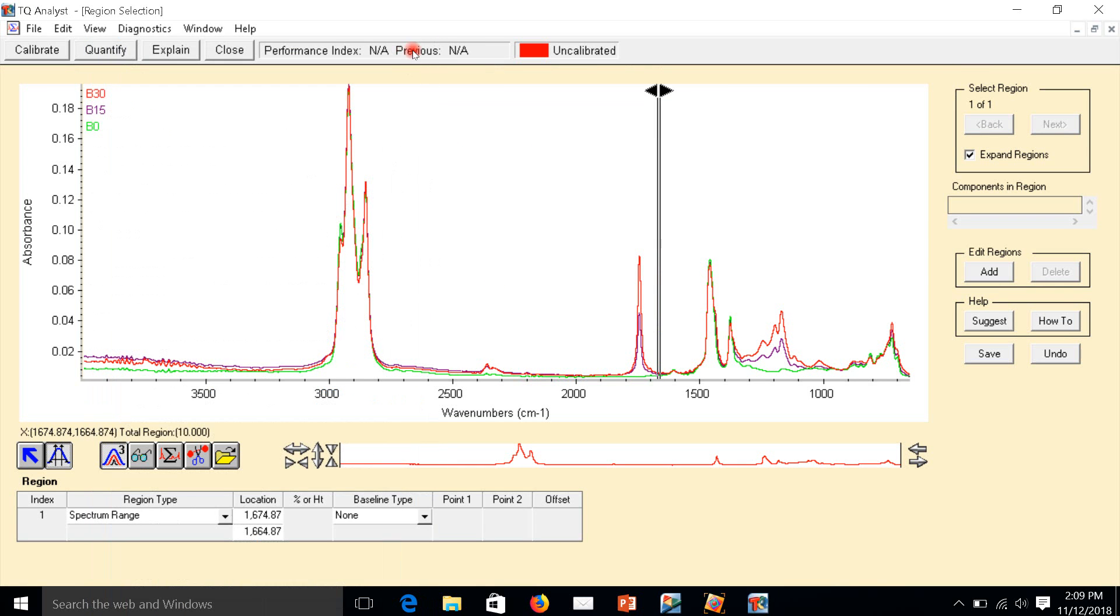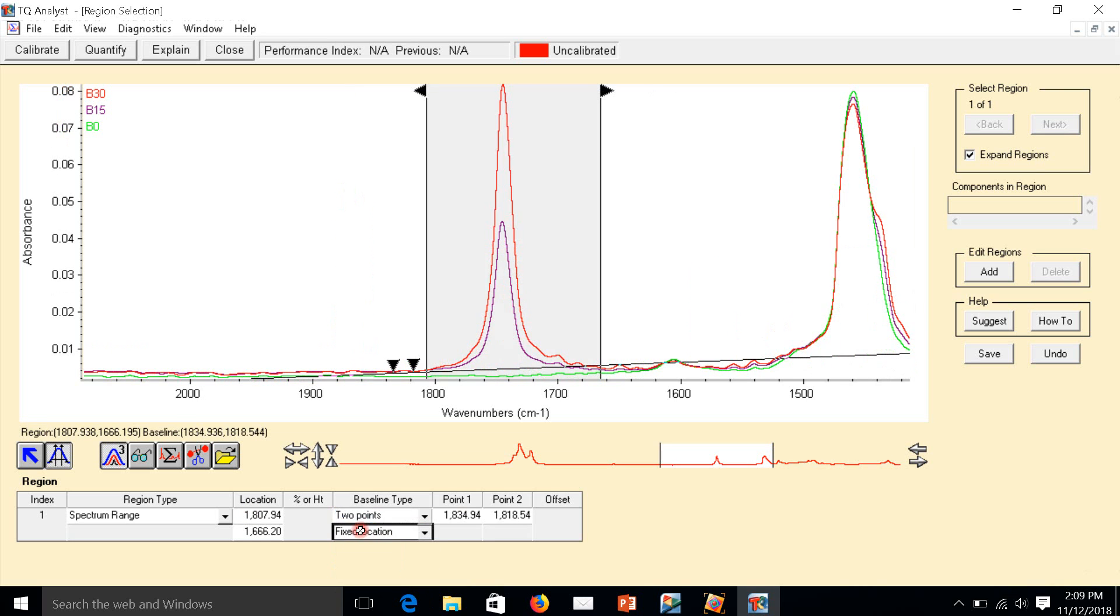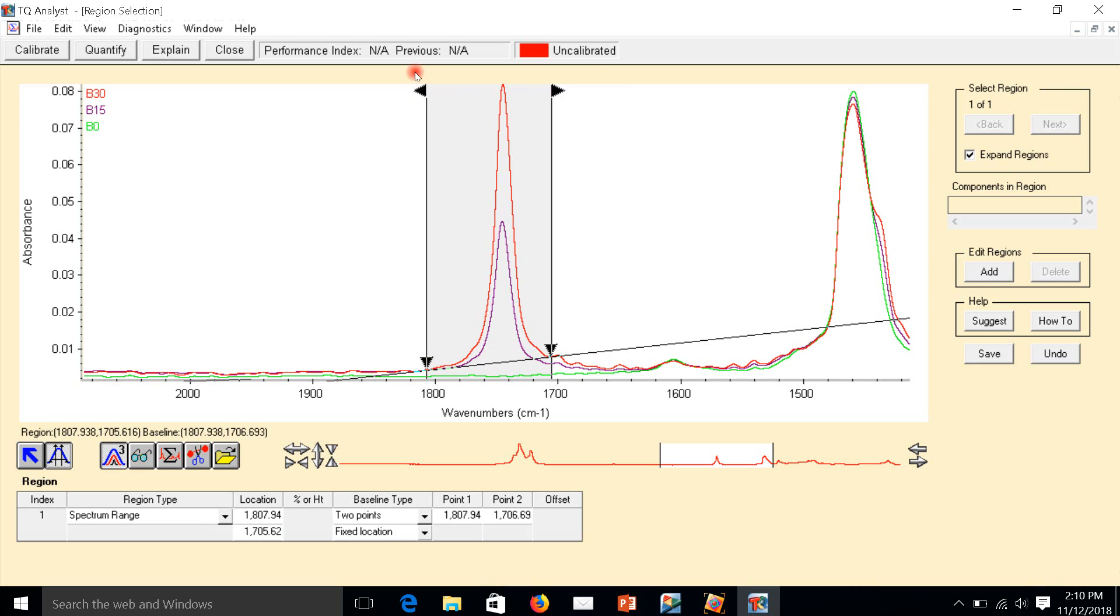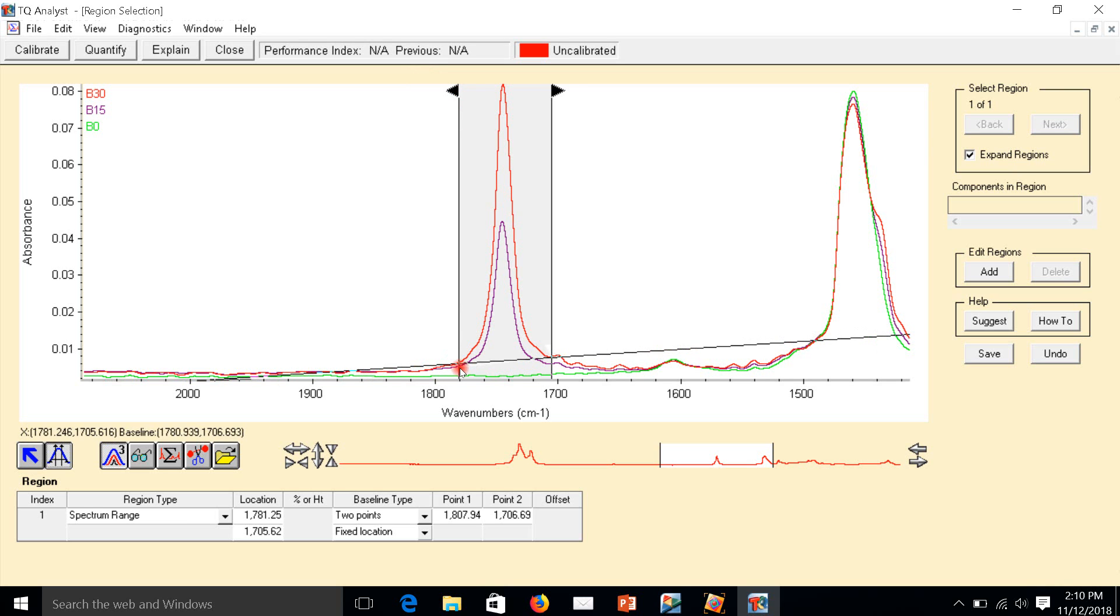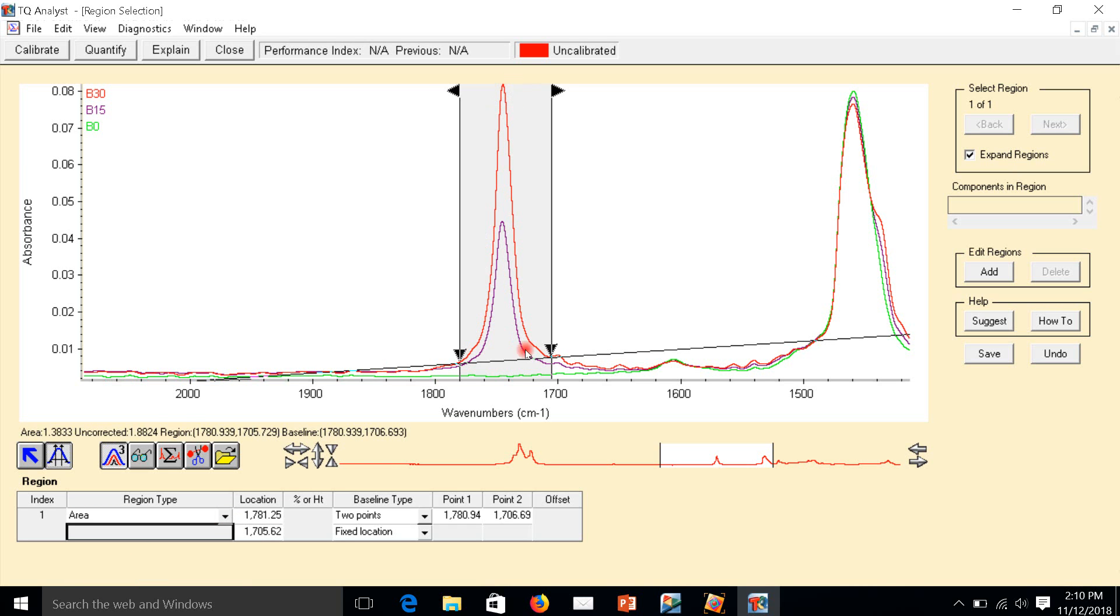Now editing region. We have to edit the region around here. Then we have to use two-point baseline here. I have to drag the baseline. In ASTM there is baseline and area you have to choose. This area is around this value. We have to choose here, area.